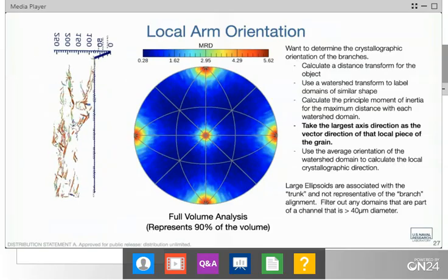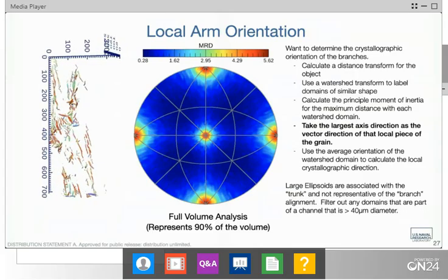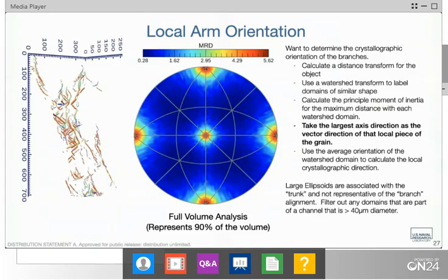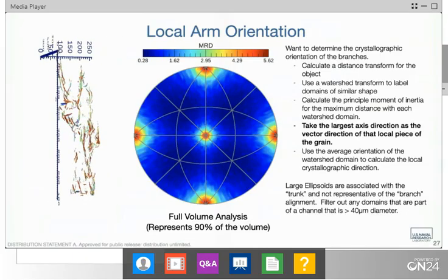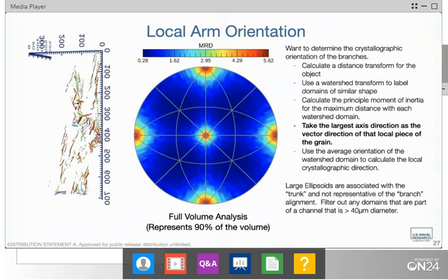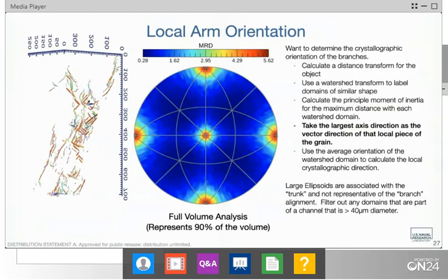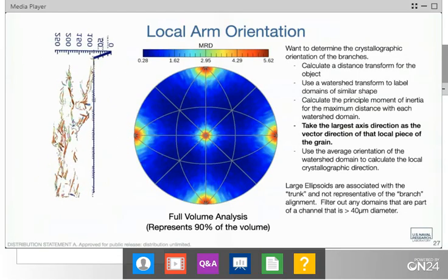So yeah, the vast majority of that is done with Python scripting with the TESCAN MIRA, as well as talking to our robot and sending some signals to the RoboMet. So that's mostly done through Python. And then we're negotiating through the TEAM API. And yes, we are continuing to work with EDAX on that and to make sure that it's robust.